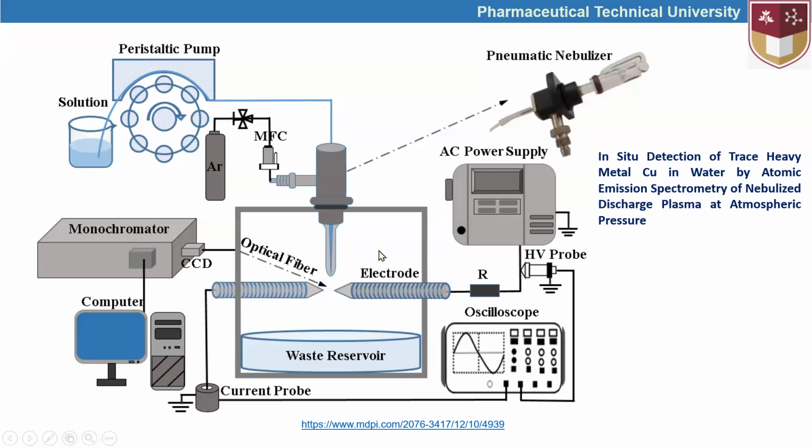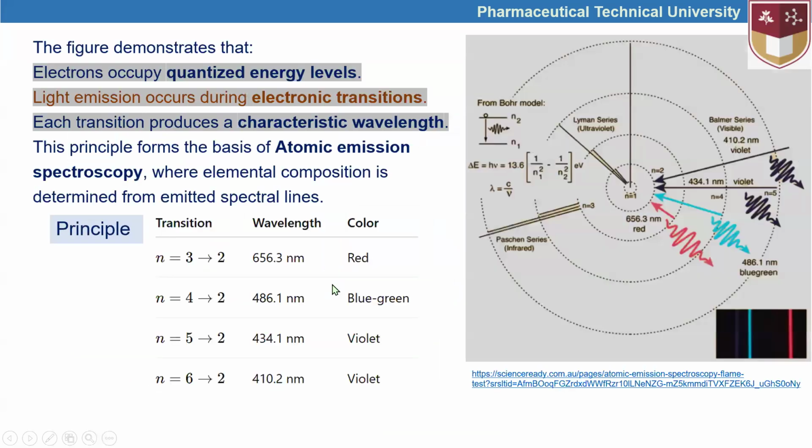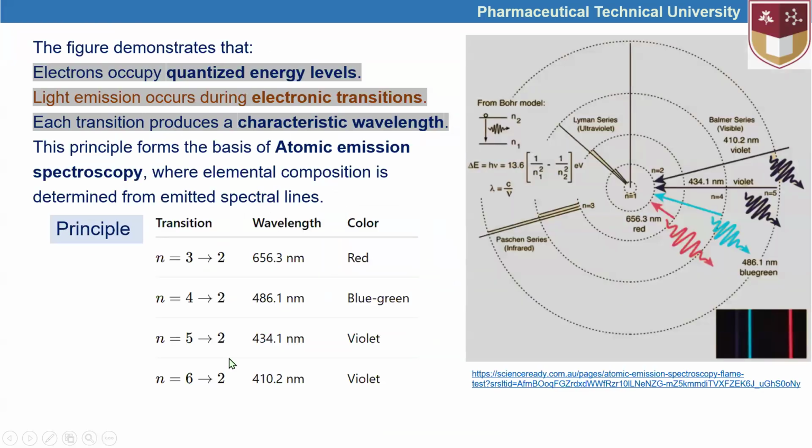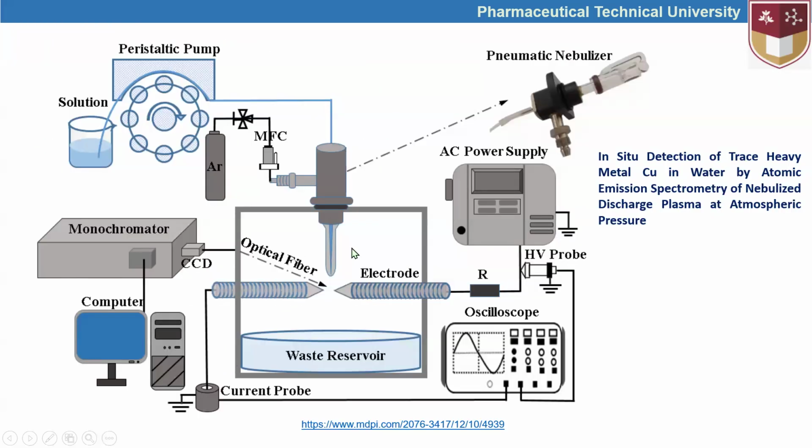What I would like you to pay attention to is the monochromator. Monochromator stands for selecting a shorter range of wavelengths of the light. It's not necessary in all cases to study the whole light spectrum. Based on a short range of the light, it can be possible to identify some metals, so it can simplify the analysis.